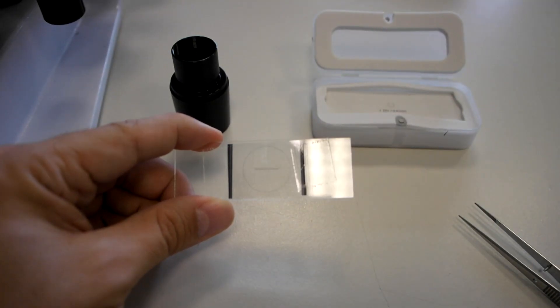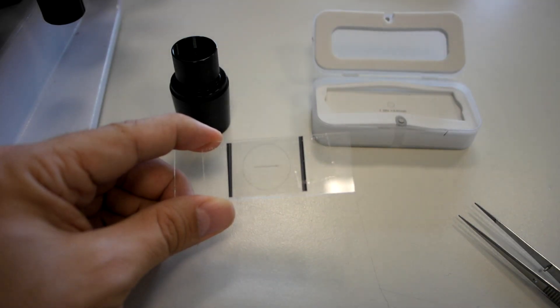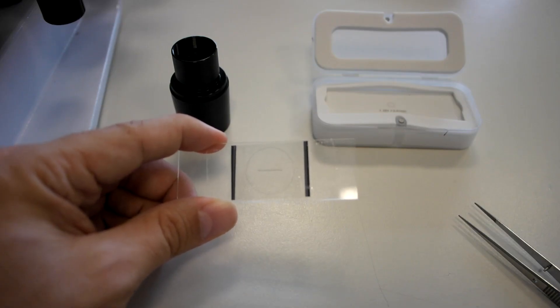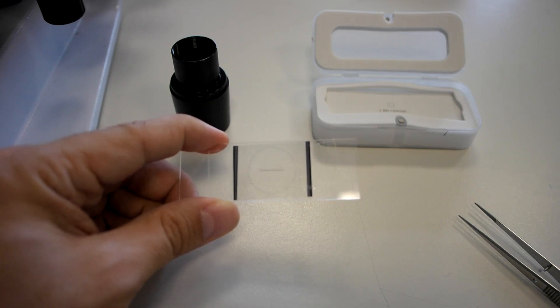Here is a stage micrometer. A stage micrometer is a very accurately etched glass or plastic ruler that is placed on the microscope stage, so that the eyepiece graticule scale is superimposed on the stage micrometer scale, so that we can calibrate — we can measure the actual distance that can be measured with one division of the eyepiece graticule.